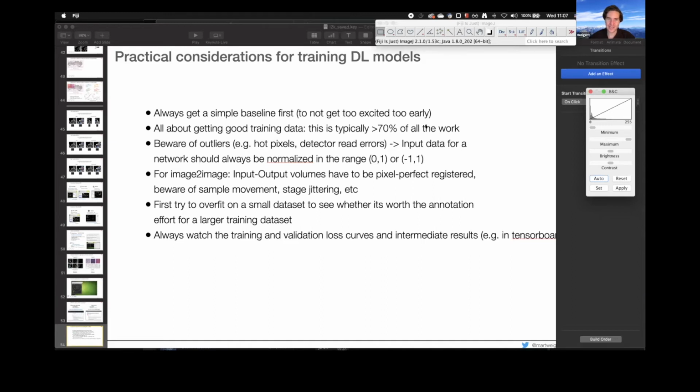And in principle, if you have a lot of objects that are touching a little bit, your watershed will always fuse them, because you just get one seed for two objects that are fusing, and there's still a dent, so it still looks like two objects. What StarDist in principle cannot do is predict something that is bean shaped, right? Or that has two spheres that are touching. So it's forced to predict two objects there.